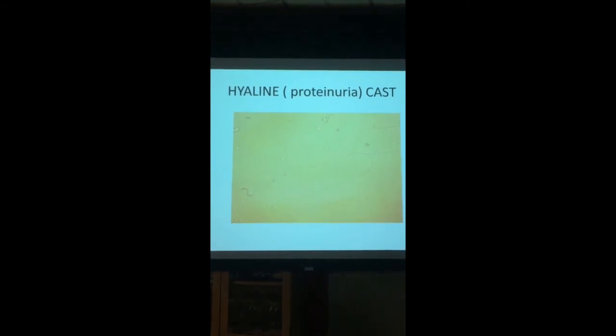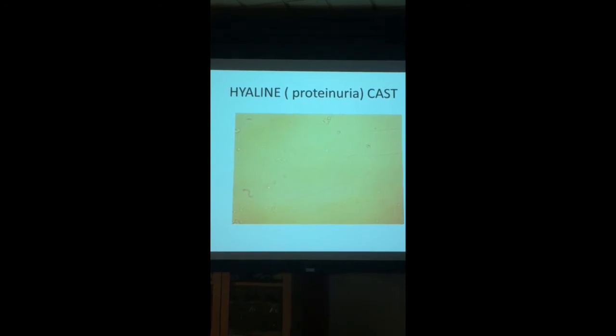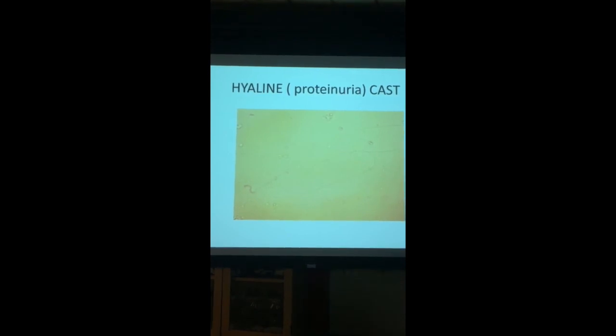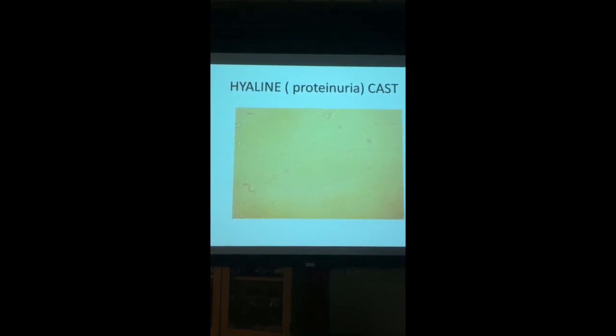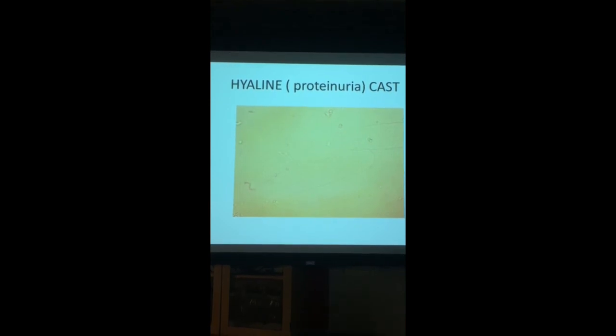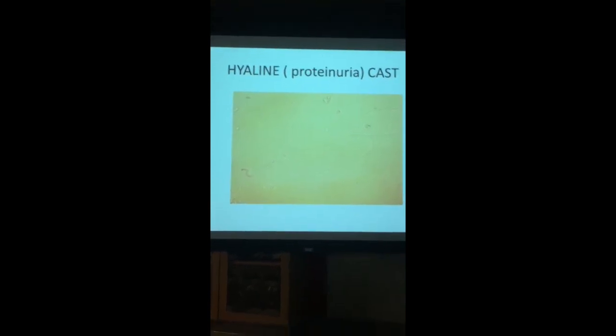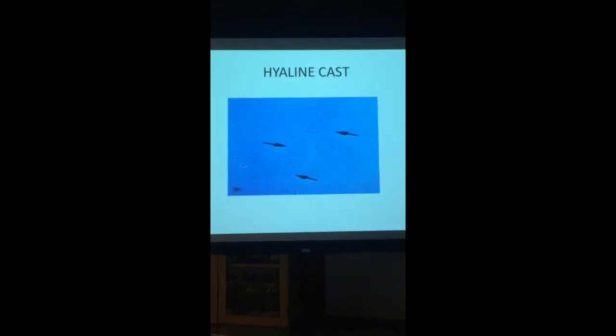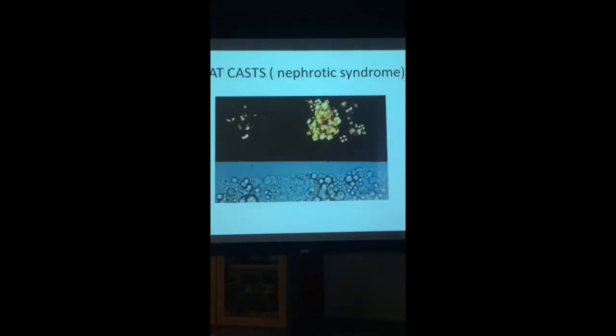Hyaline deals with protein in your urine. So look, it's so light. It almost looks like just so light you almost can't see it, like a ghost footprint. So think hyaline. It's like a very soft word. It's a very soft kind of cast. Just go with that. Okay? Very soft. You almost can't even tell it's there.